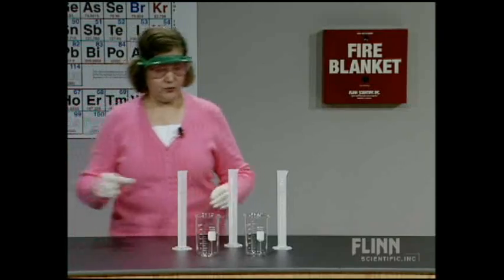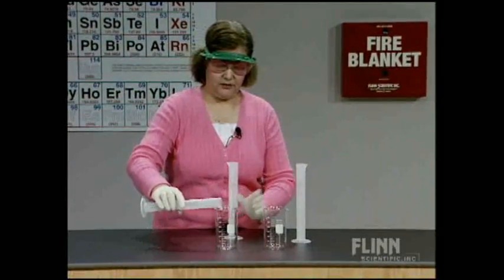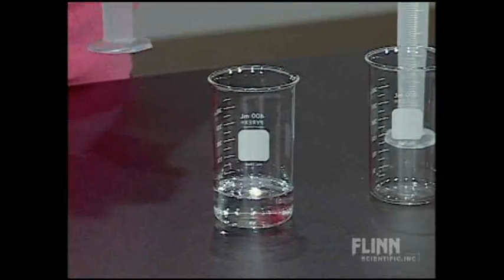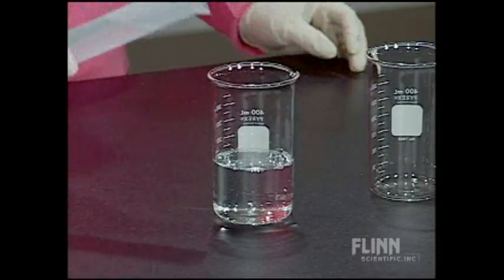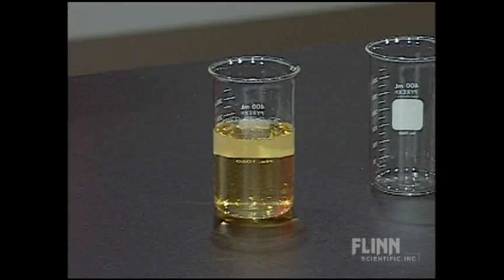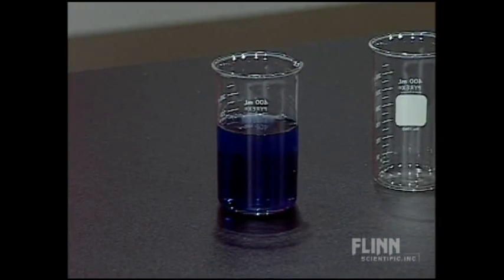All right. So we have 3 reactants. And what we're going to do is pour them together into this first beaker. So I'm going to add the first one. And these are all colorless solutions, you'll notice. I add the second one. We're still colorless. And I'm going to add the third one. This is nice because you really don't have to stir it. Immediately upon adding the third one, it turned yellow, and then it turned blue. Okay, so far so good.